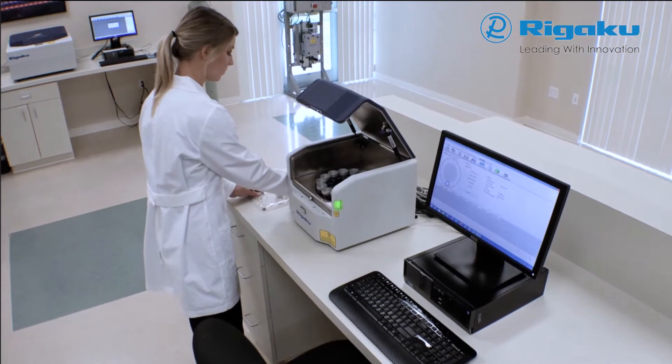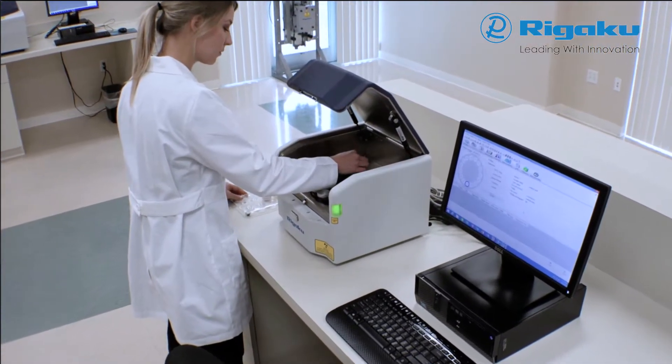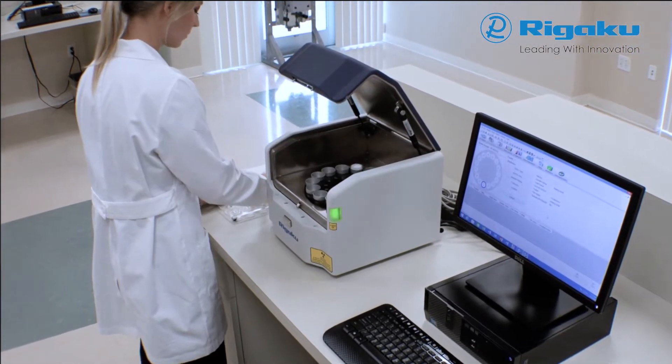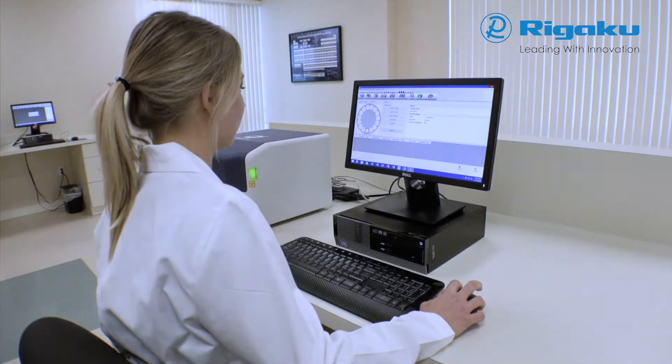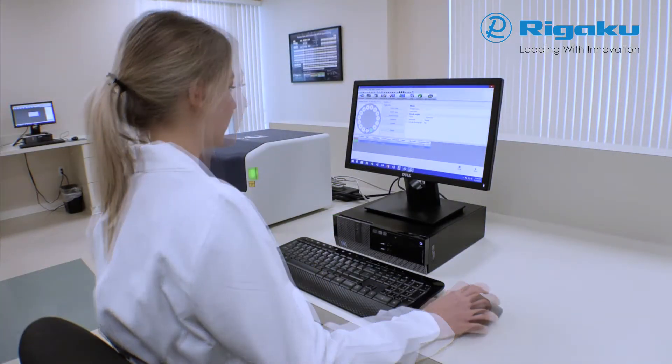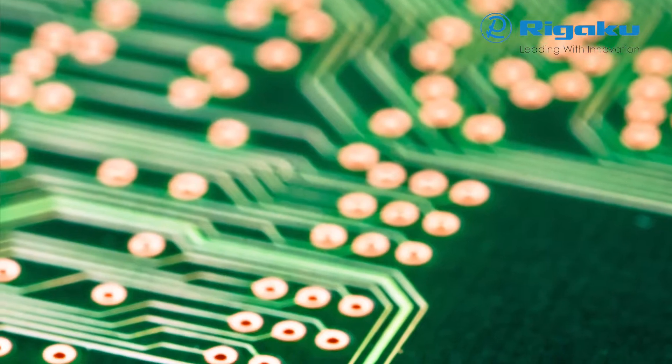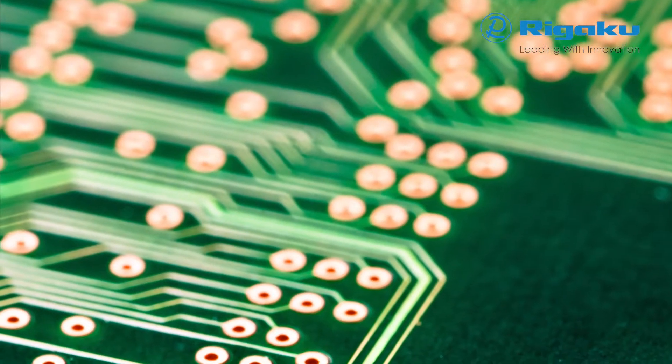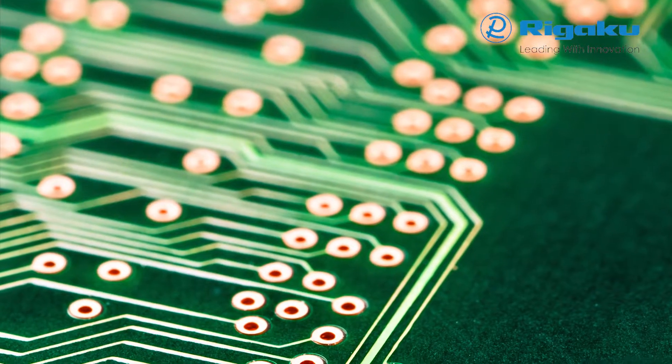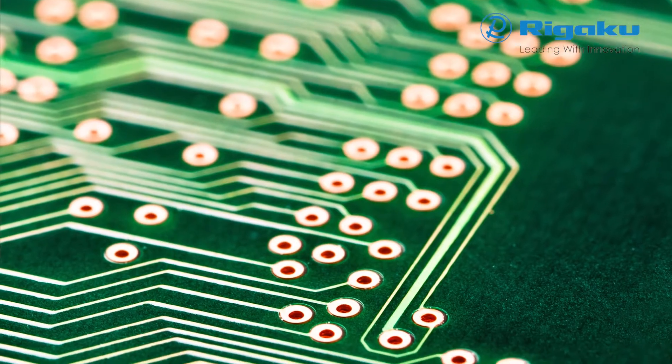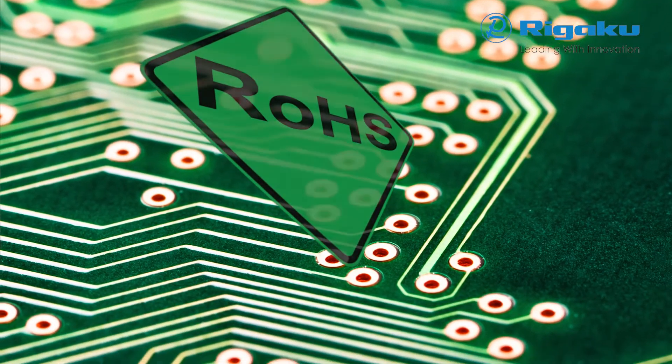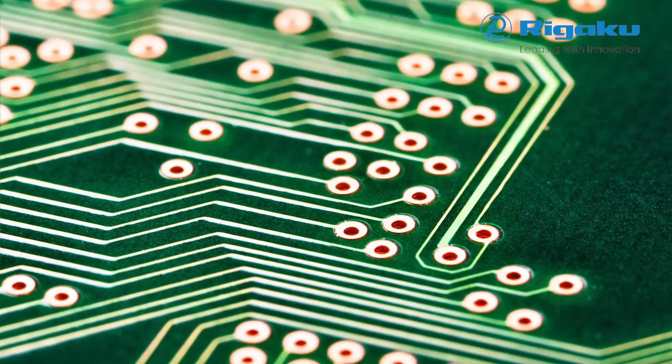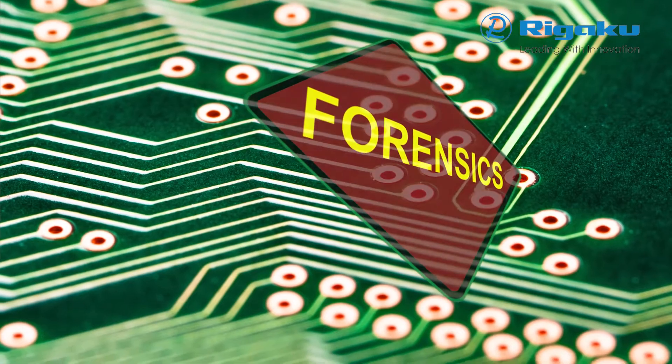With the smallest footprint in its class, the NEX DEVS delivers accurate results with unsurpassed reliability, flexibility and ease of use to meet any challenge, from lab to production floor. Small spot analysis capabilities with a precision camera system provide the flexibility to address ROHS, forensics and specialty applications.